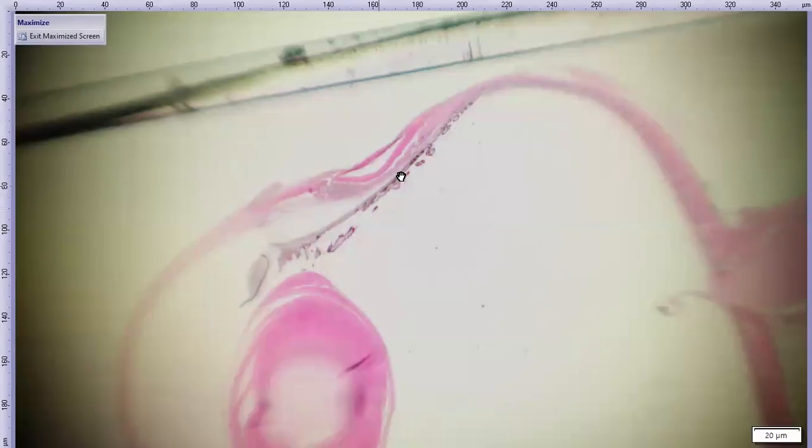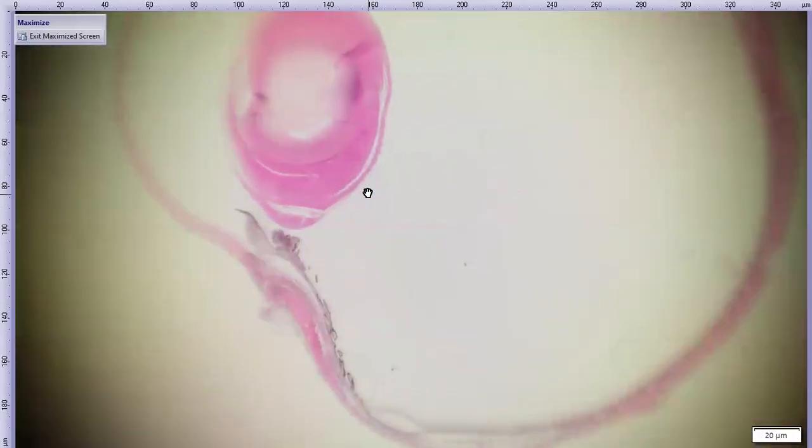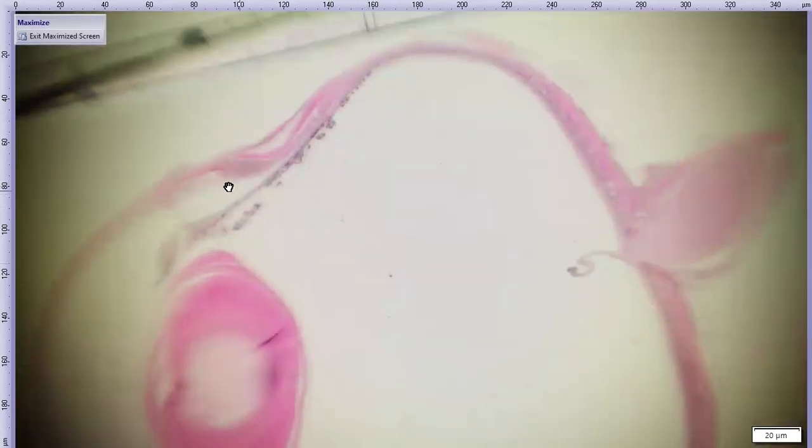So here you can see this is the scleral ossicle, the bone, and in a bird it's actually several ossicles that are kind of tied together, and they wrap around like a belt at the level of the limbus, where the cornea meets the sclera. And then you can see this annular pad here at the equator of the bird lens. So let's use a little more magnification.